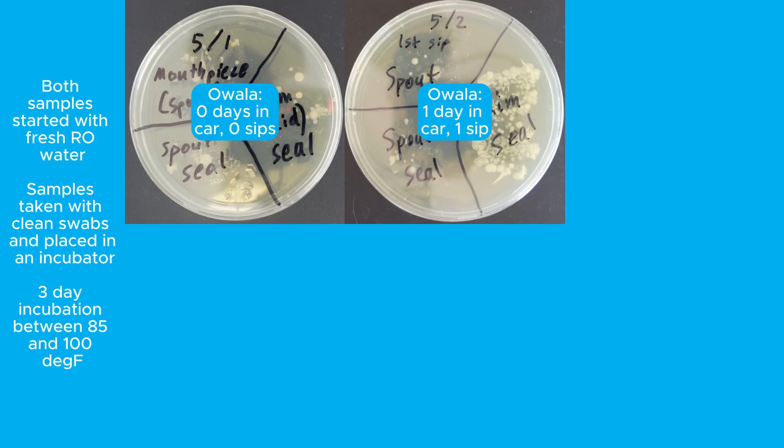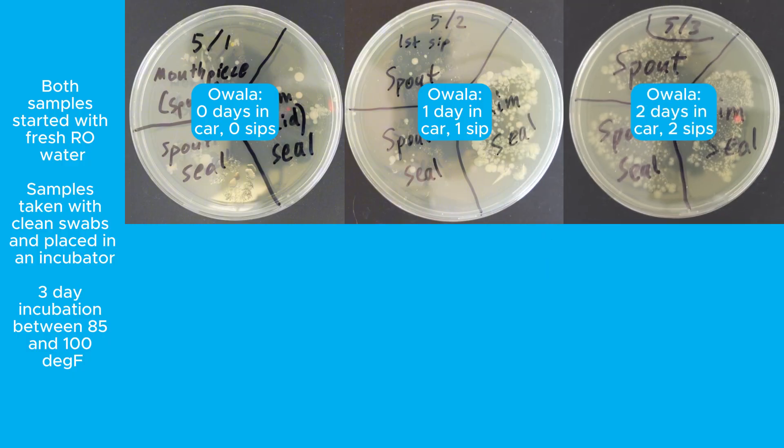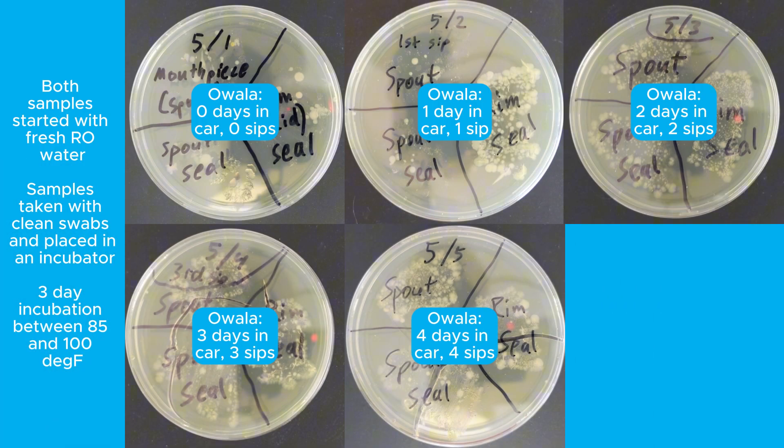But that changes when you look at the next sample, which was taken after 24 hours in the car and one sip and one chug from the spout. The rim seal in particular showed a lot more bacterial growth, but the spout and spout seal were still low. But after 48 hours in the car and two sips and chugs, you start to see more growth from the spout and the spout seal. And on the days after that, the samples start to look similar, and you can see high levels of bacterial growth from all sampled parts of the bottle.